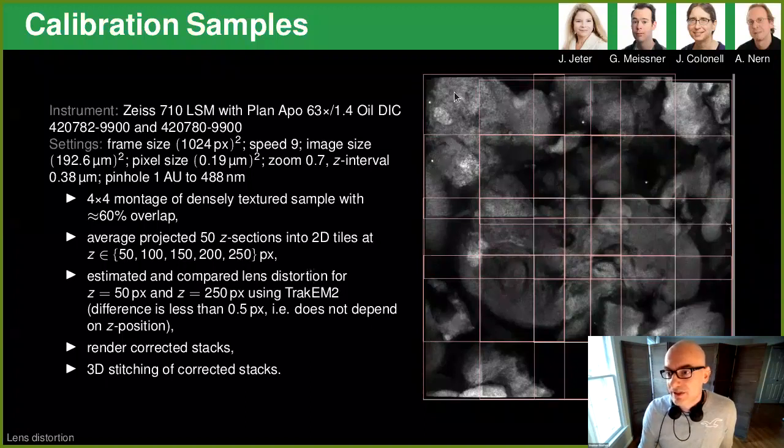And so we tried to establish a good setup for calibration tiles, so good texture. Since they are imaging brains, the first idea was, why don't we throw all the brains that weren't properly prepared onto a big heap? So we generate a brain pile or brain heap, and we image that brain heap, and we established a lens correction model for that. And that indeed worked.